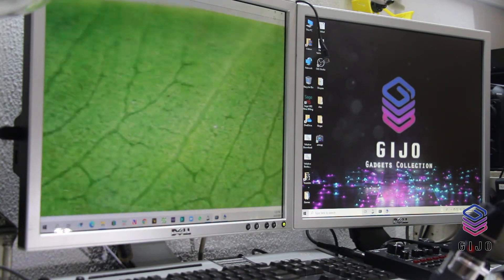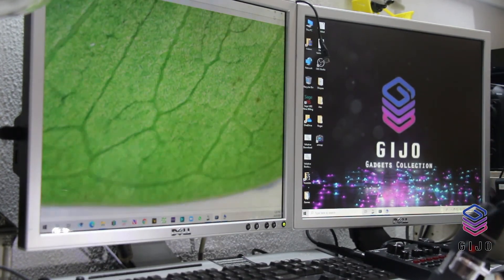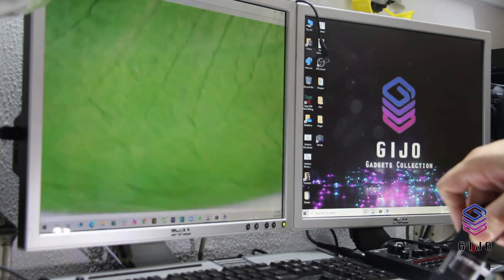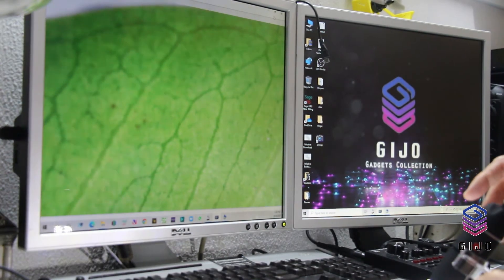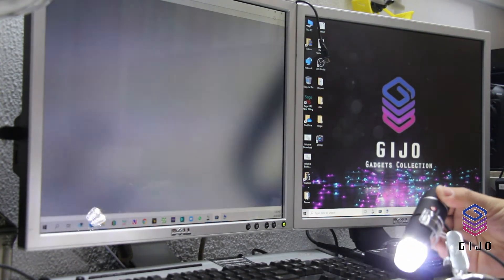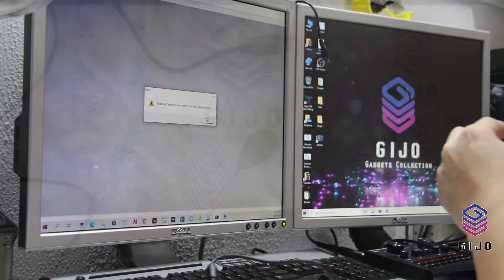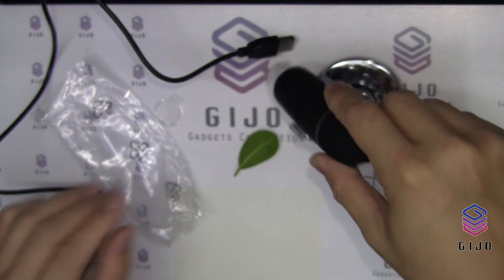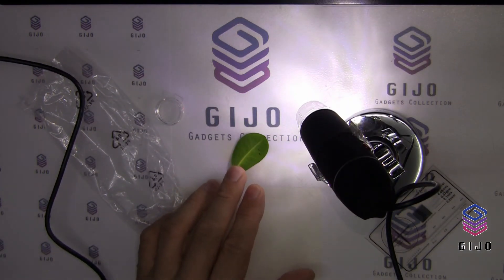This is fun, this is interesting. Now I get it — I think it's the other way around. This is showing left as right, so it's supposed to be flipped. Anyway, this is it — it's using a USB port and there are LEDs. So probably we need to do some calibration.